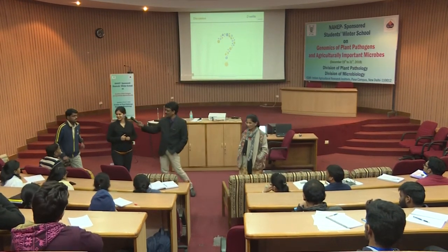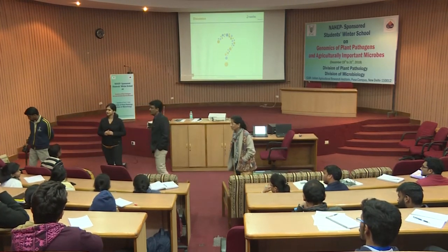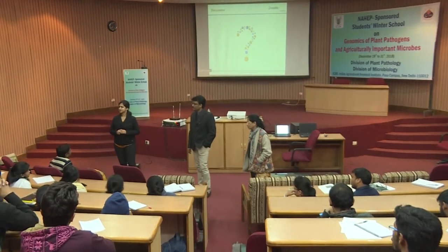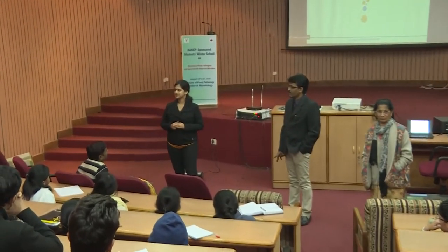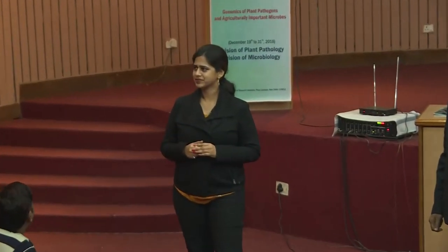Anybody else? There was a question from this side. In case of SNPs, you told that a cutoff minimum like 8x, somewhere 8x to 10x. But we are going for a coverage of 50x or even 100x, you told. Then why is the cutoff for the SNP less? It should be at least more than 60-70%.